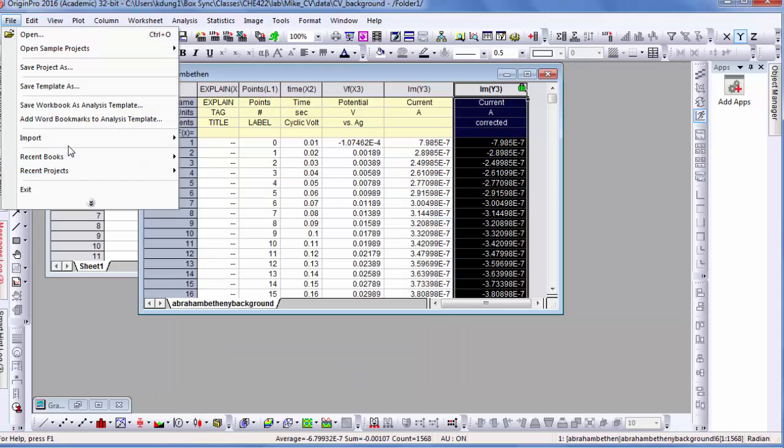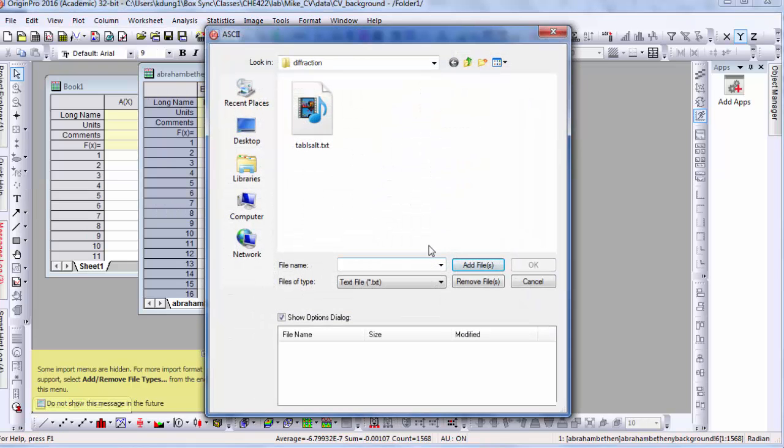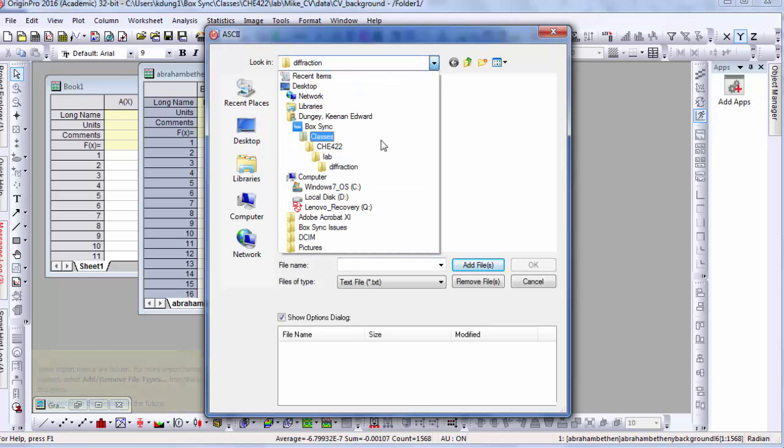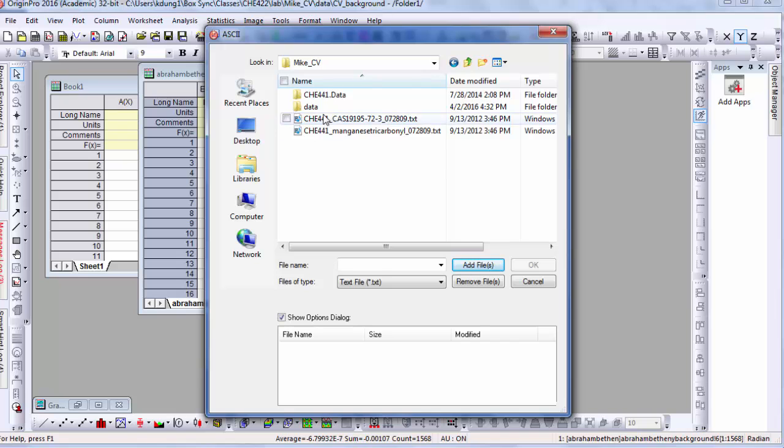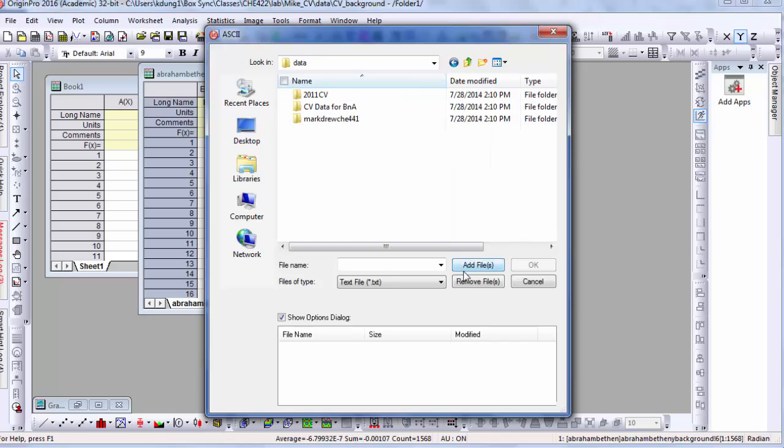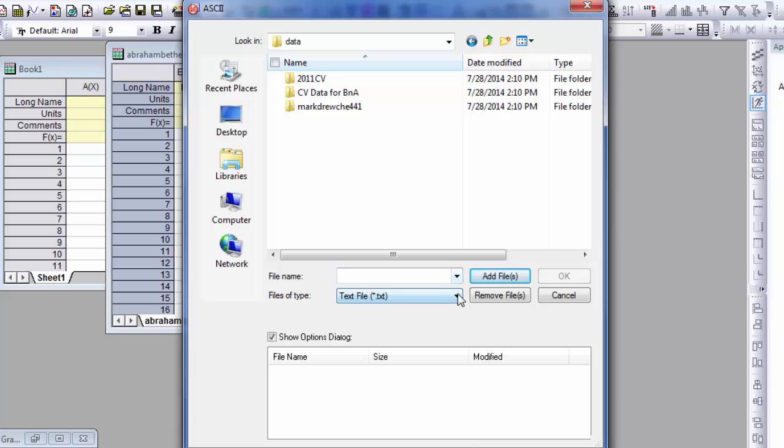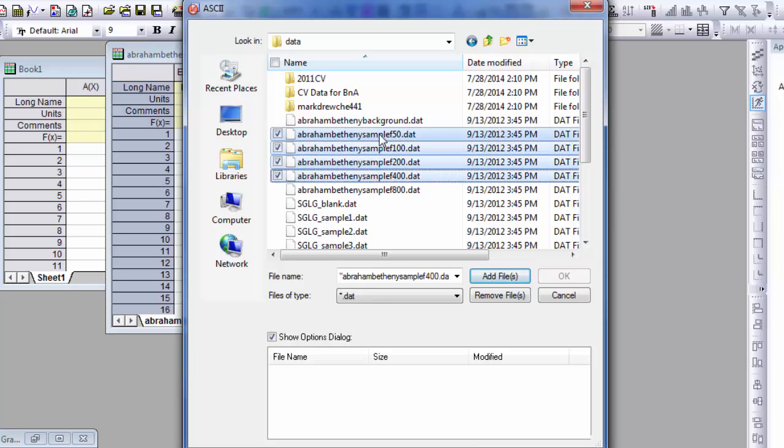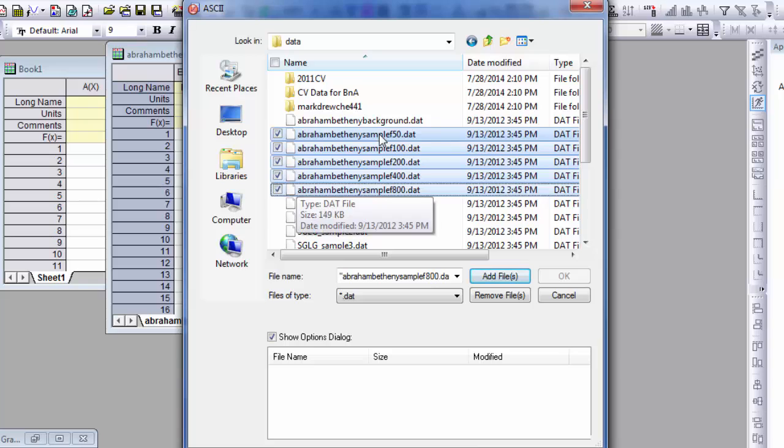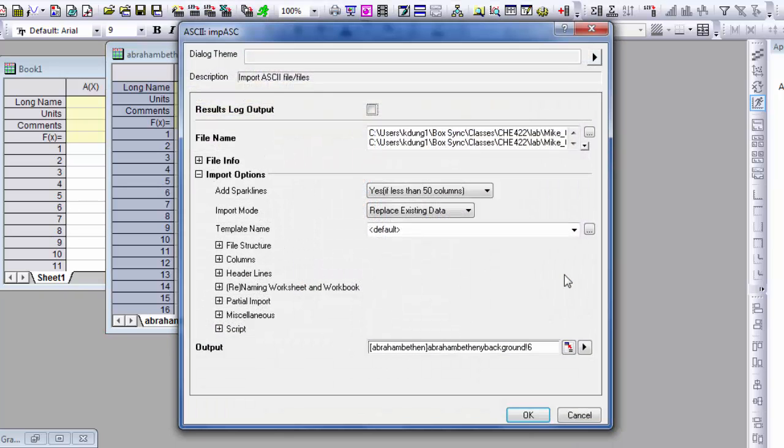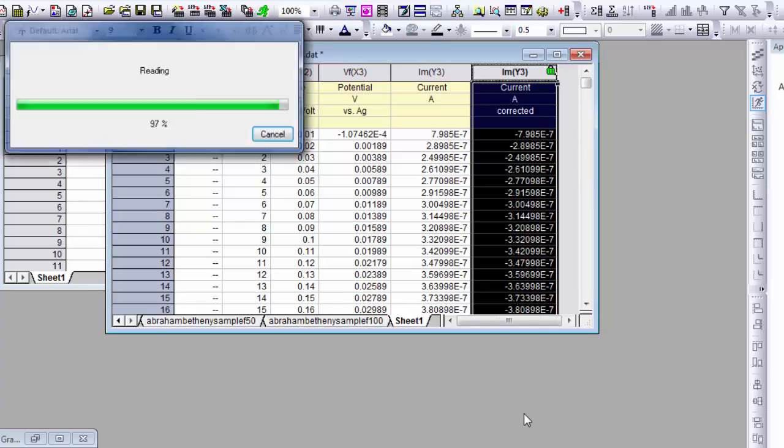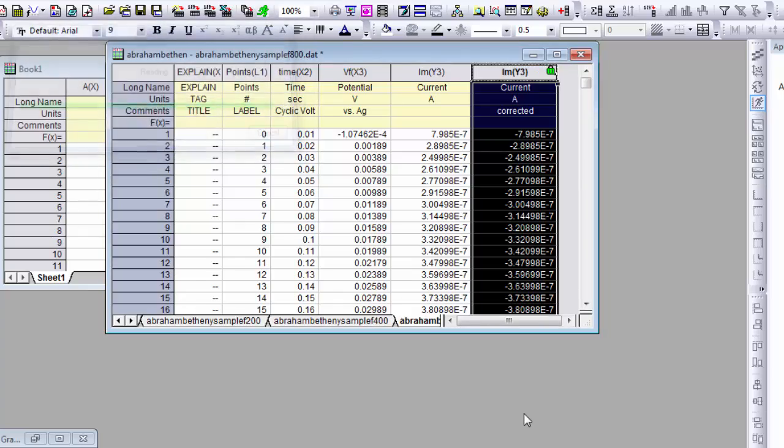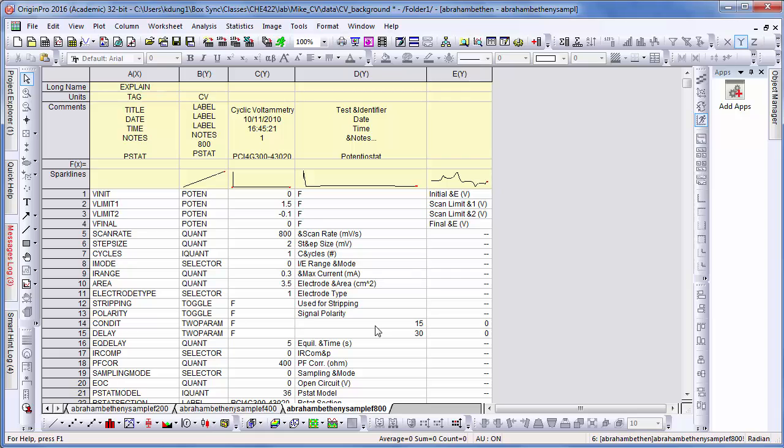Also actually you can import more than one file at a time. So you can do multiple ASCII. We could go to our data folder and for any .dat file, we can select all of these. So we can process them all at once and get the data we need for our lab reports. Start new sheets for each one. So here they all are.